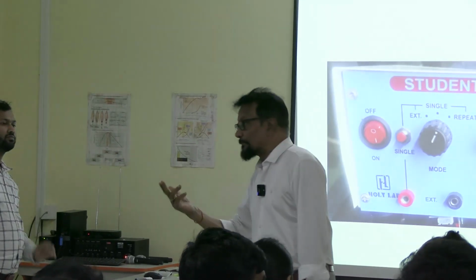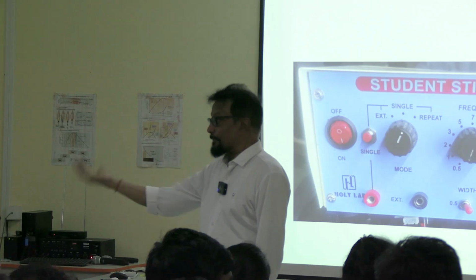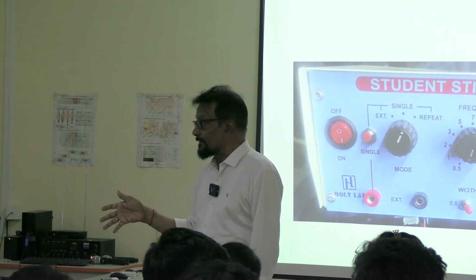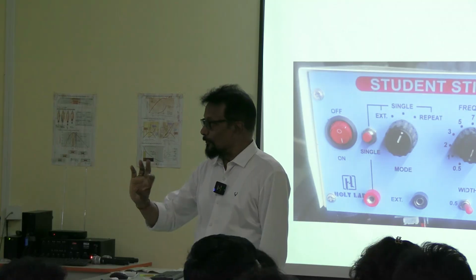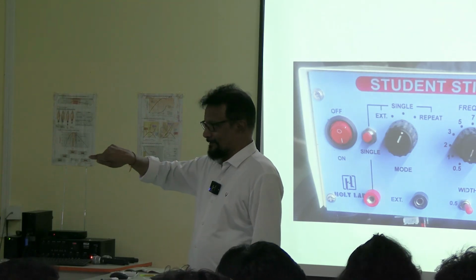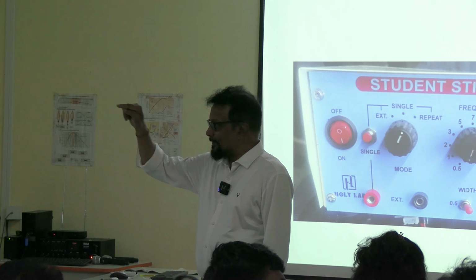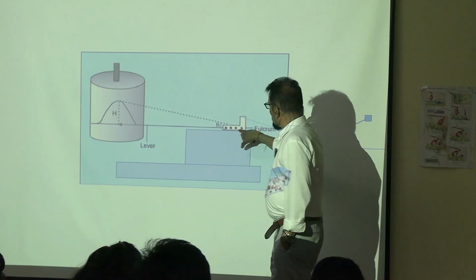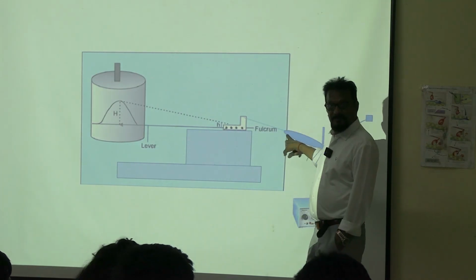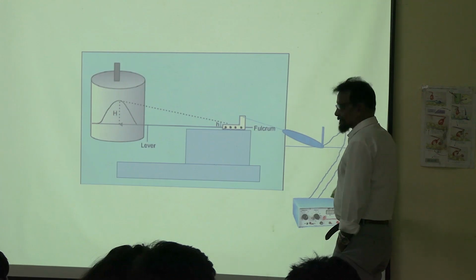If you want more than one stimulus, sometime we will be experimenting with repeated stimuli to see what happens to the muscle when it is repeatedly contracted. So from here we can send the appropriate stimulus to the muscles. We have a recording device, a stimulating device, and the muscle. Let's see the other part: long arm, short arm, this is the fulcrum, this is attached to the gastrocnemius muscle, this is the sciatic nerve, this is the stimulator, this is the electrode.